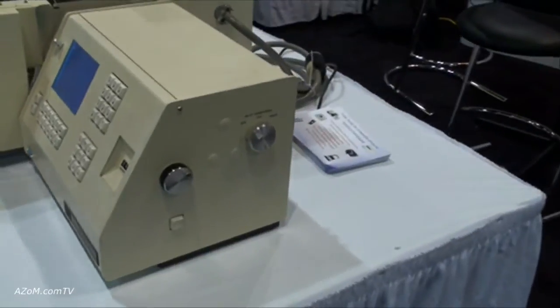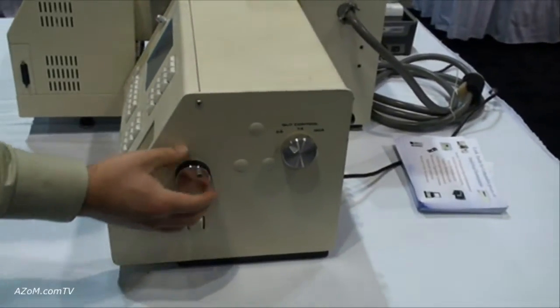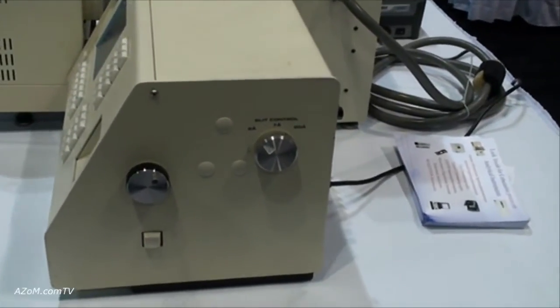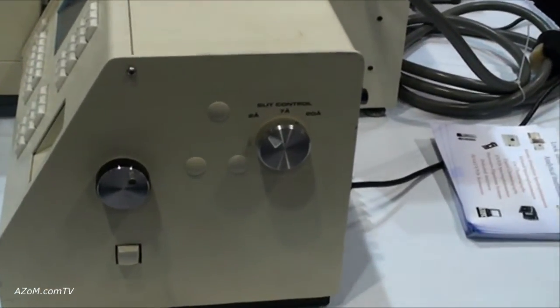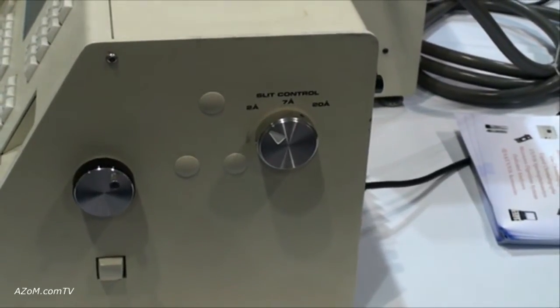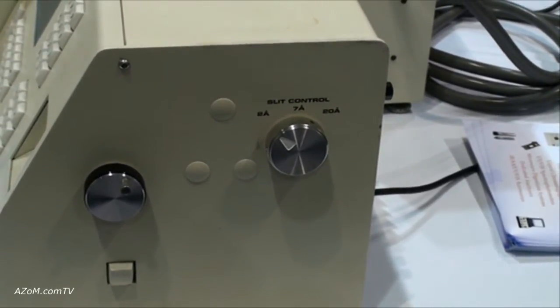This is the monochromator control and the slit control over here. Again, they're manual, which allows for simplified use of the instrument and aligning the lamp for optimal functionality.